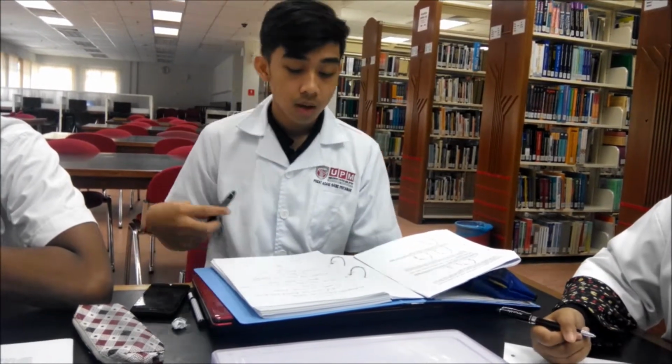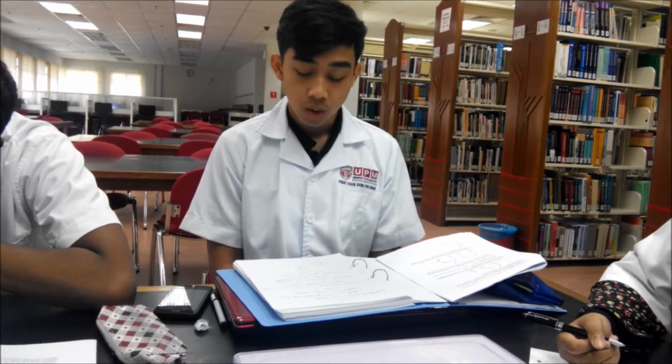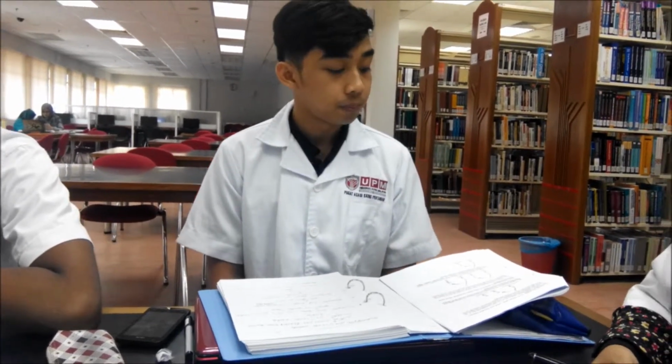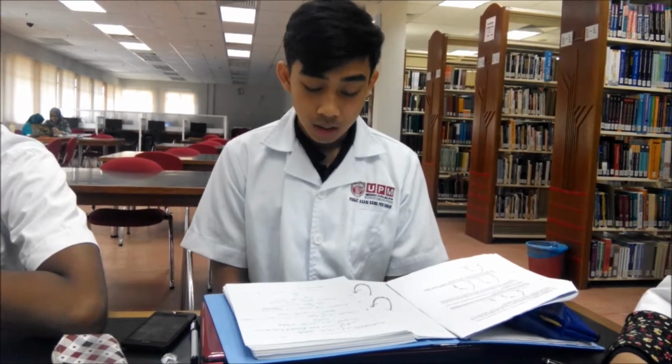And then we continue to the variable of the experiment. So we pipette 1 ml of enzyme into the enzyme reaction tube. The enzyme reaction tube already contains substrate, so once we put in the enzyme, the reaction will quickly start. After putting in the enzyme, we mix it slowly, and then after mixing, we quickly start our timer. This is because this part of the experiment is really time sensitive.